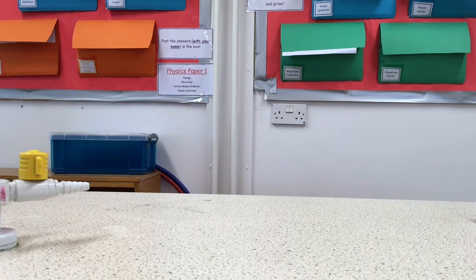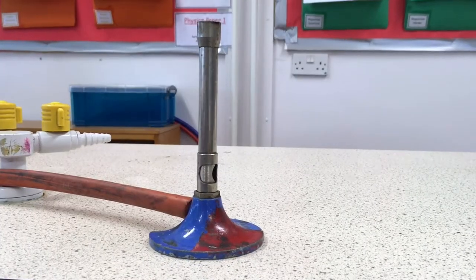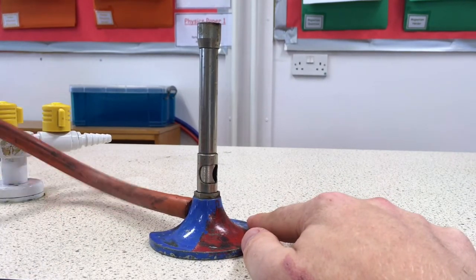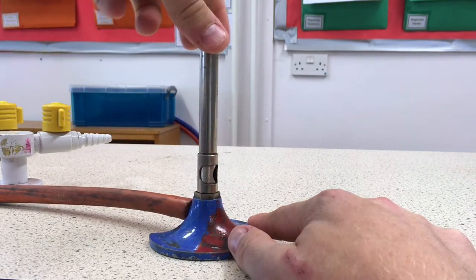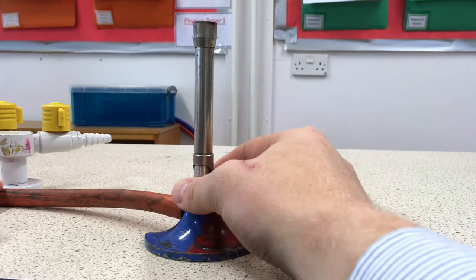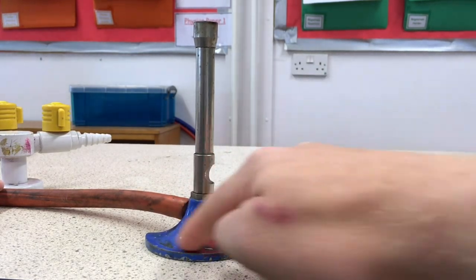In order to set up a Bunsen burner we need to understand how a Bunsen burner looks and works. Here's one I had earlier. A Bunsen burner is made of several parts: we have the tube which connects it to the gas, we have this long sticky-up bit called the barrel, and we have this rotating metal cuff called the collar, and we have the base.